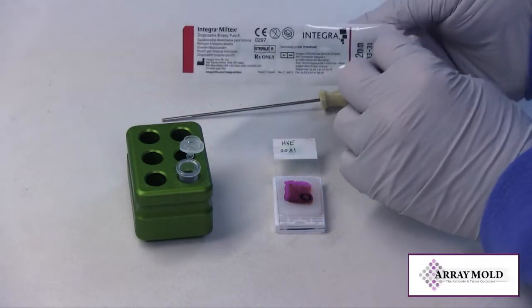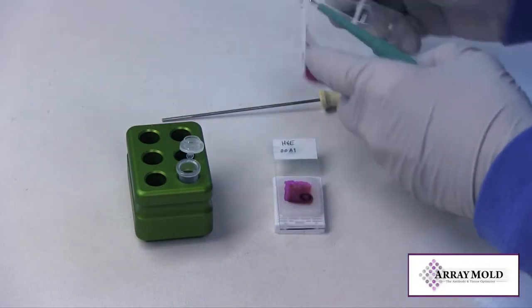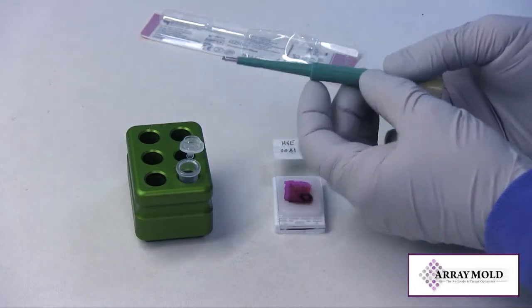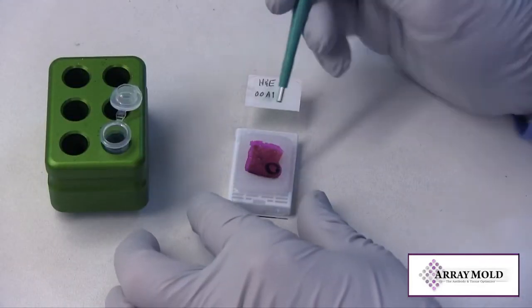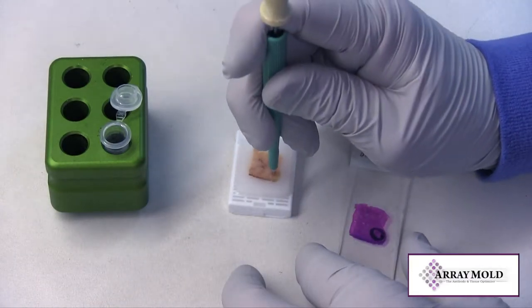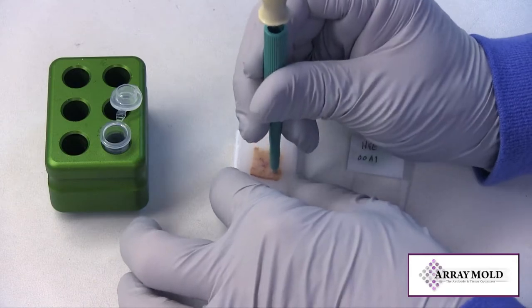When you're punching for DNA, always use a new needle and never reuse needles. Insert the stylet. This is what you'll use to extract the tissue from the needle. Use the slide to pinpoint the area you will be punching. This is why an accurate H&E slide is important here.